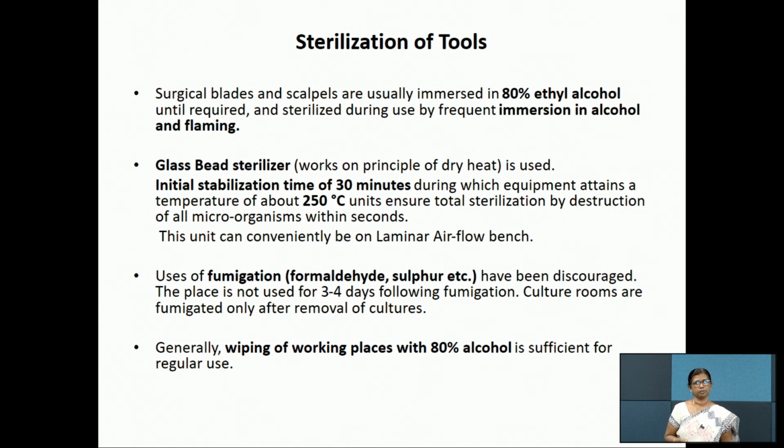Most importantly, most labs follow fumigation, but that should be discouraged because it is very carcinogenic in nature, so you have to avoid it. It is always better to clean all the benches using 80% alcohol. That itself will remove all the contaminants in the work area.